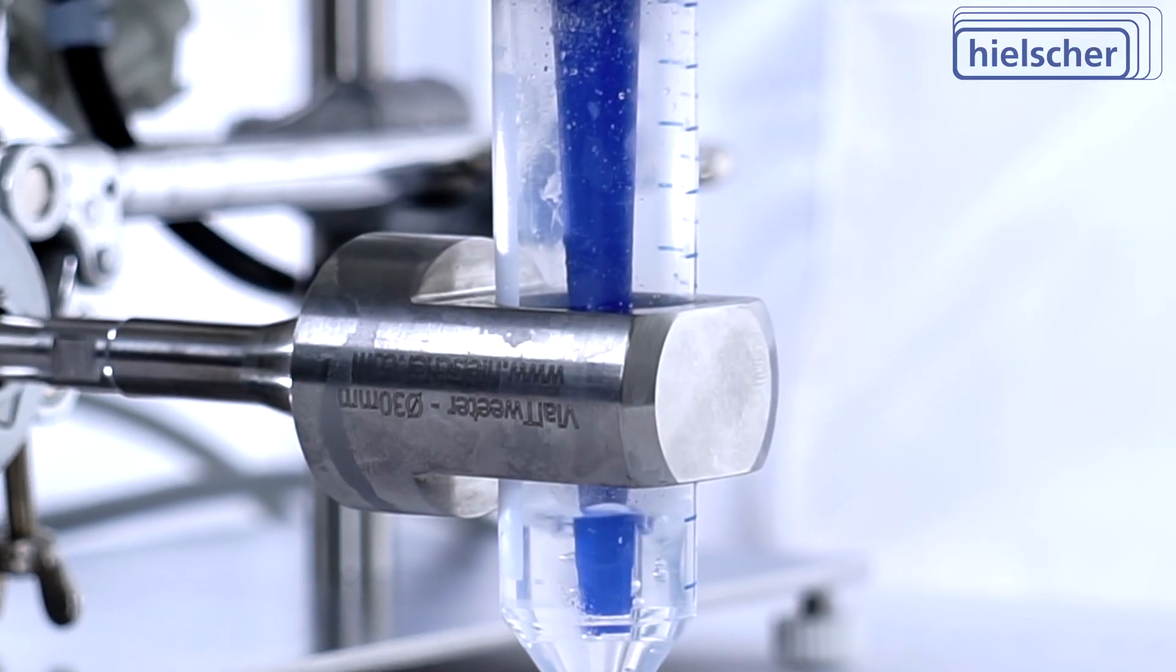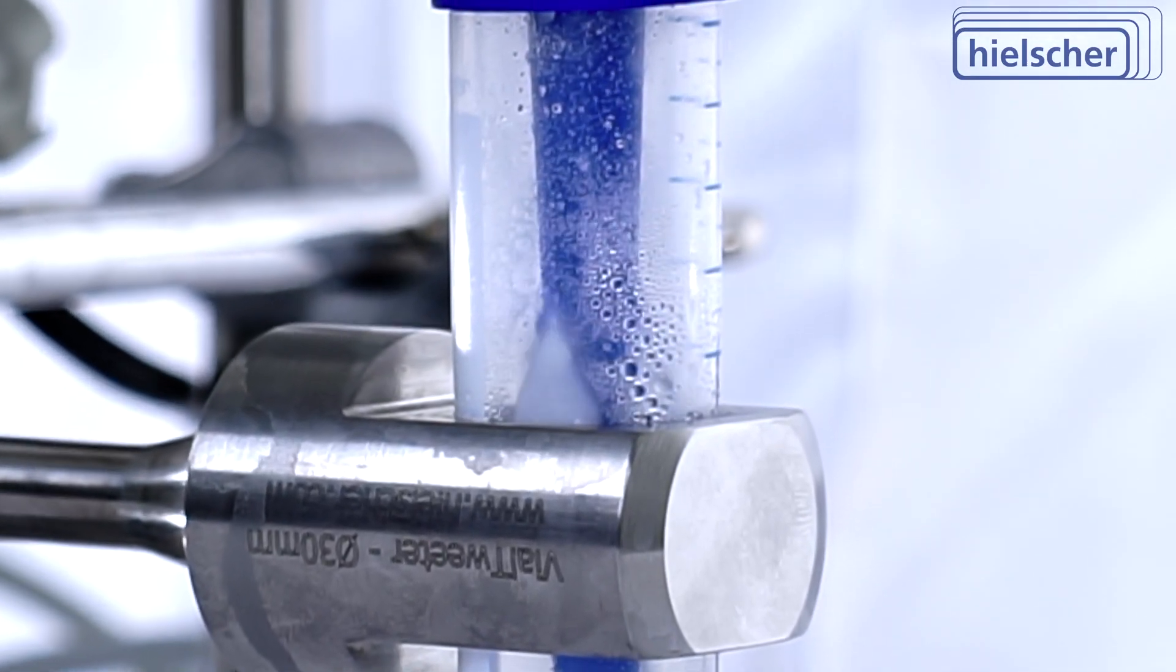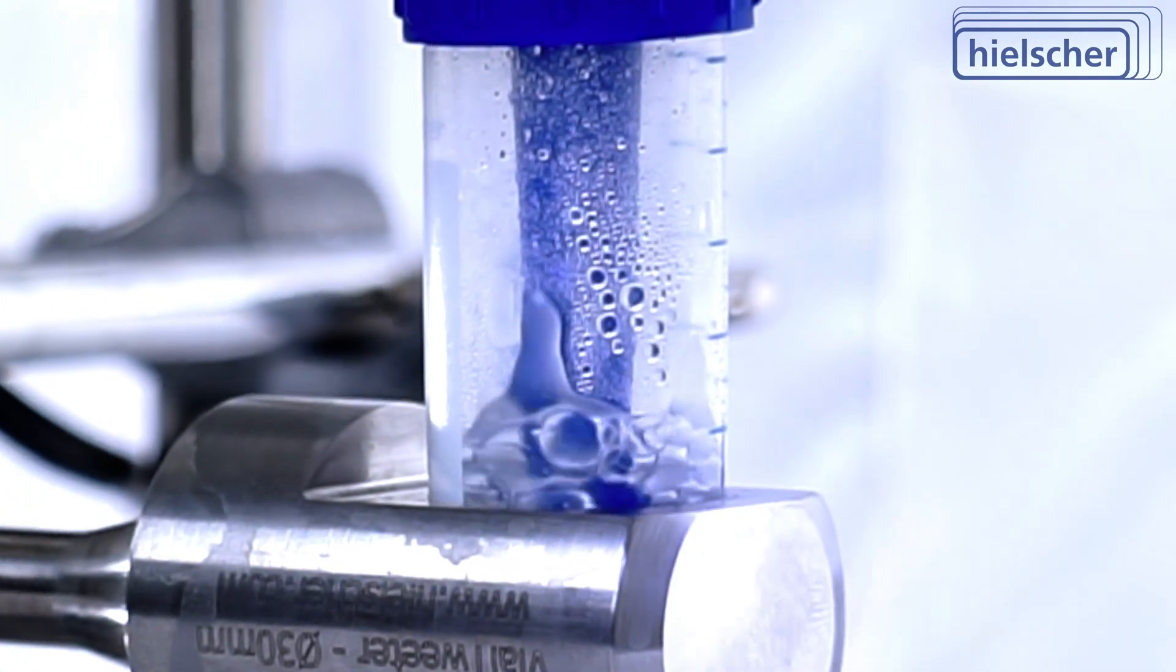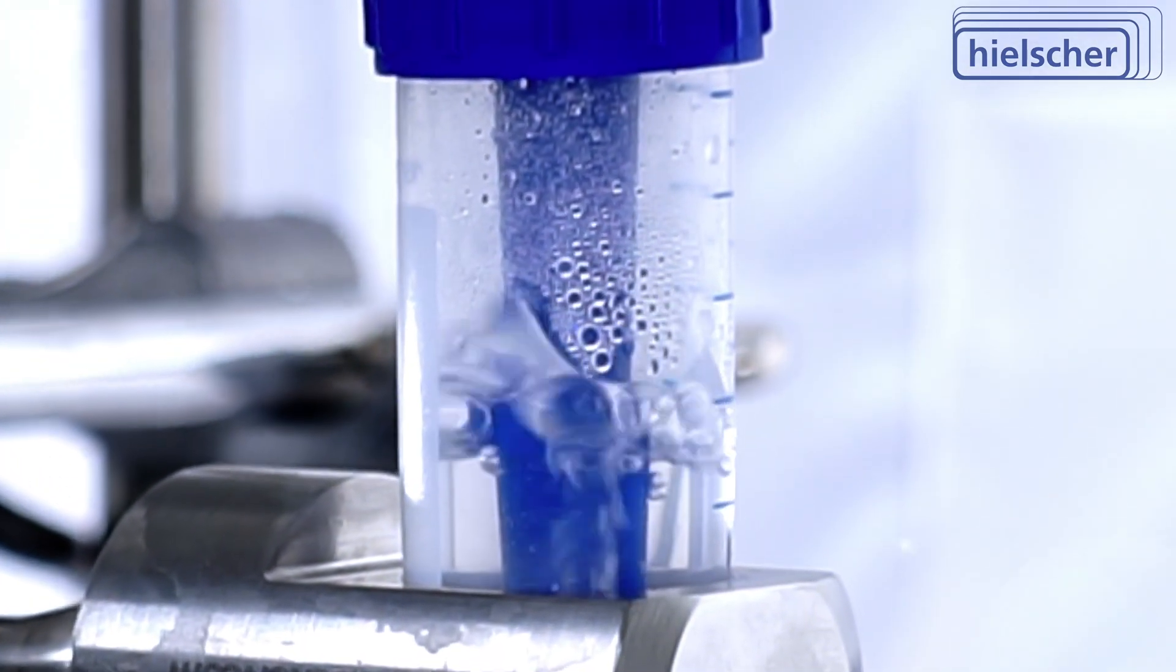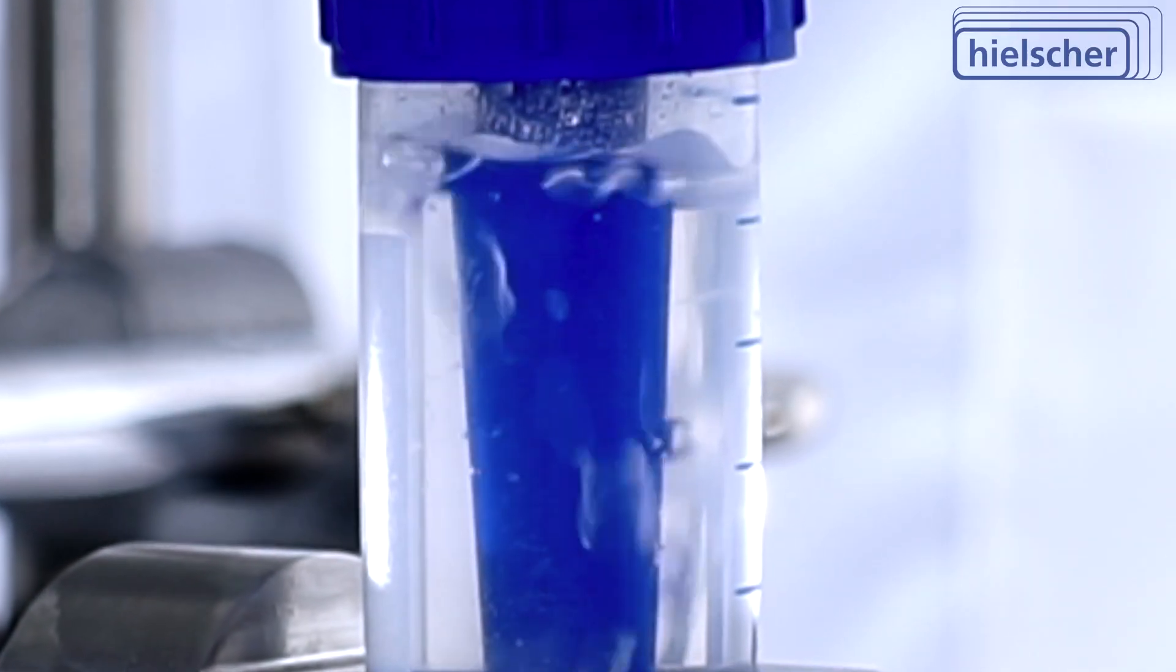These advantages and applications underscore the Vial Tweeter's capacity to drive new innovations. In drug development, chemists can test various reaction parameters or screen active ingredients in a compact, continuous flow setting.